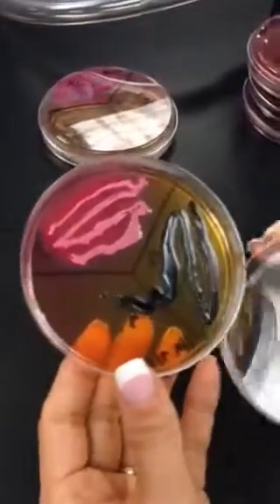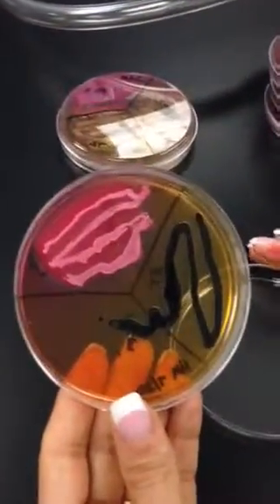So, the Shigella salmonella agar inhibits gram-positives and selects for gram-negatives. But if your gram-negative is salmonella or Shigella, which are non-lactose fermenters, instead of getting lactose fermentation, you're going to get the black precipitate.